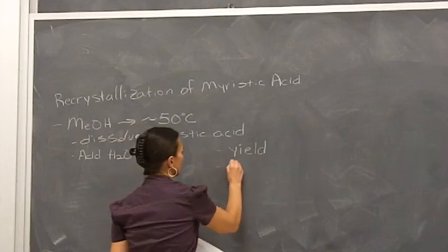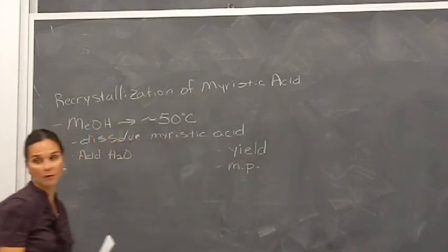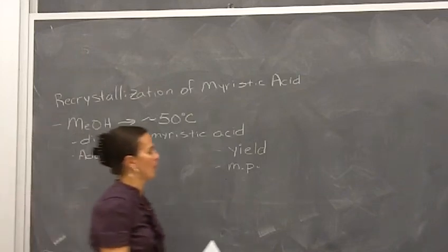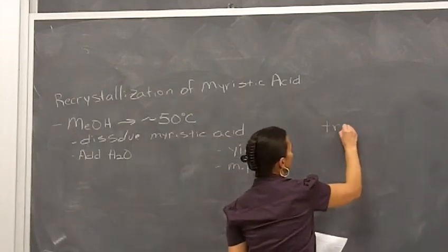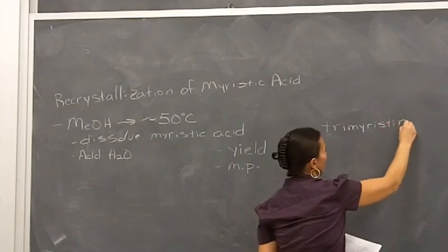We will also need a melting point for the myristic acid. Our trimyristin, we're starting the lab period off with getting our yield, okay?